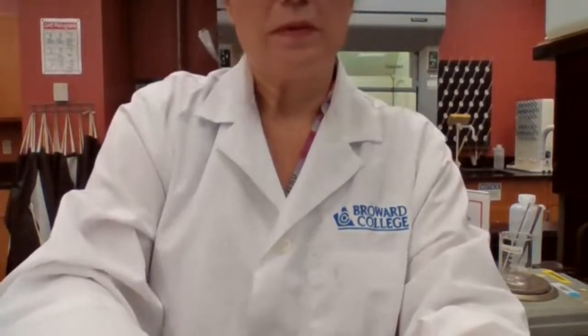This is the mass of the empty test tube.